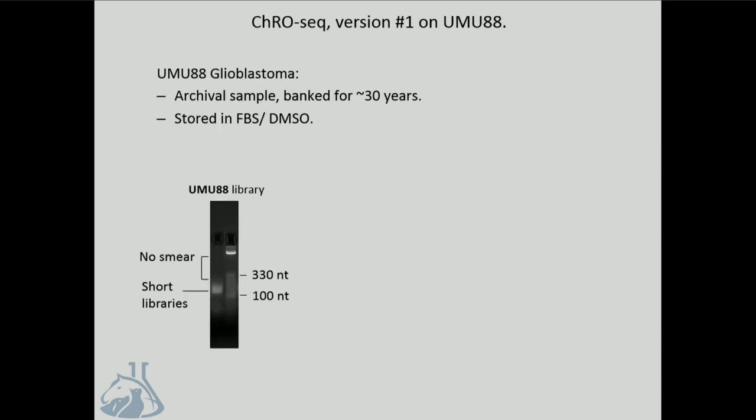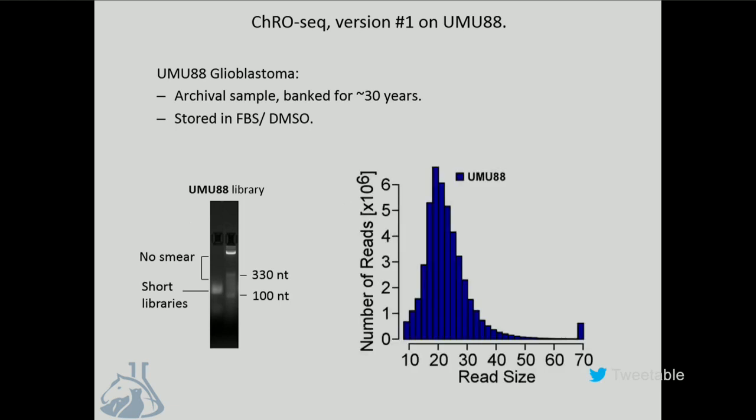Having shown that it worked, we next asked if we could apply this in tissue samples that are perhaps harder to analyze using conventional tools. The most difficult one that we have done it in so far is an archival glioblastoma that was banked in 1988—almost 30 years old. The first time we ran the assay, we got these short, little libraries that are just barely larger than the Illumina adapters. The distribution of insert sizes shows a mode of about 20 nucleotides, which corresponds perfectly with exactly the amount of RNA expected to be protected from degradation by the polymerase exit channel. So what we think has happened is that the RNA in the sample is completely degraded, but we can still get a signal based on RNA that is protected from degradation.